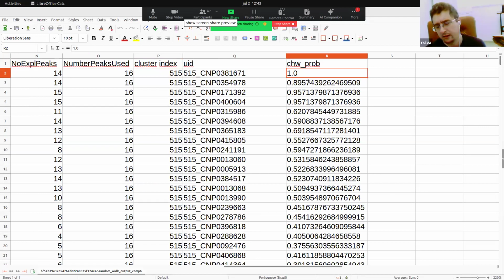Just a quick heads up for this scoring system here. It does not have meaning for an absolute value. Let's say a score higher than 0.8 is good enough. We are not able to do that. We are only able to do comparatively. I can only say that a score of 0.8 is much better than a score of 0.3. It does not have an absolute value meaning here.